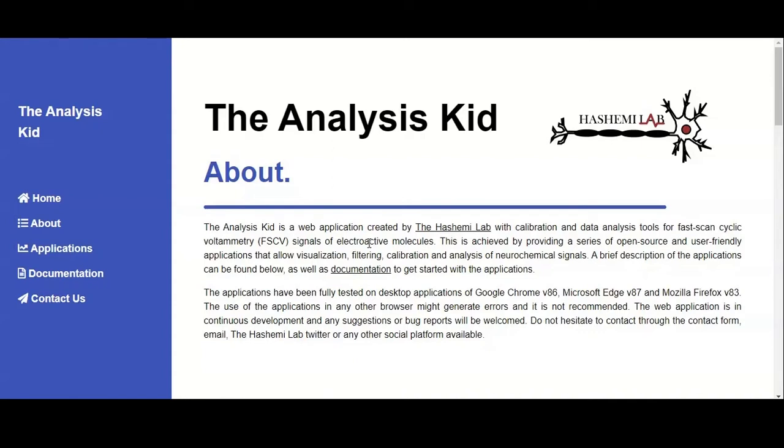Now, FSCAV is a technique that is very similar to FSCV, but allows us to monitor tonic changes of neurotransmitters in vivo. If you don't know how FSCAV works, I would suggest looking at some of the literature that I provide below before watching this tutorial or using the application.